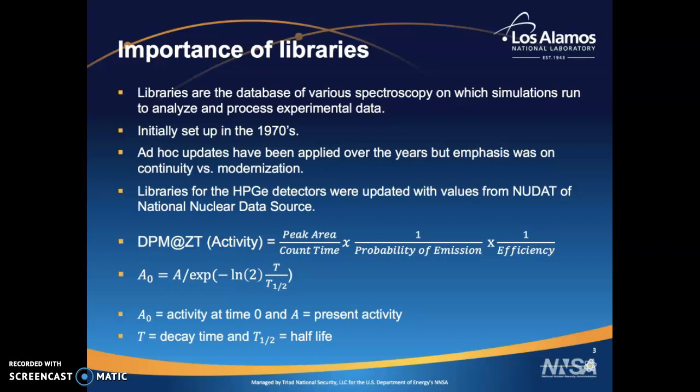Since the nuclear data has been constantly updated and improved over the years, we have decided to do a complete update to the gamma libraries using data from the NUDAT database maintained by the National Nuclear Data Center.